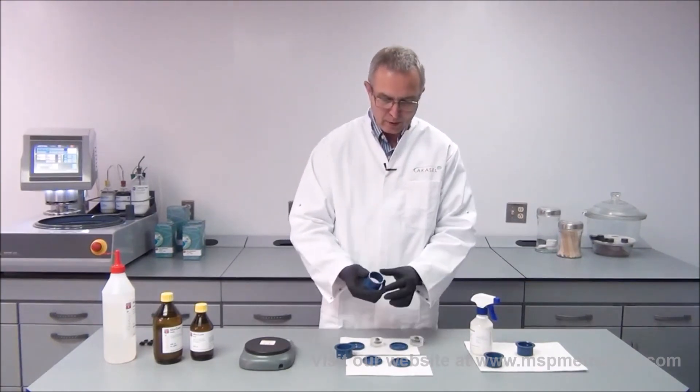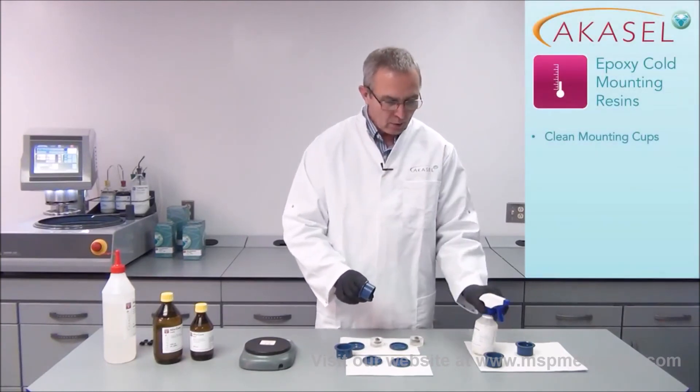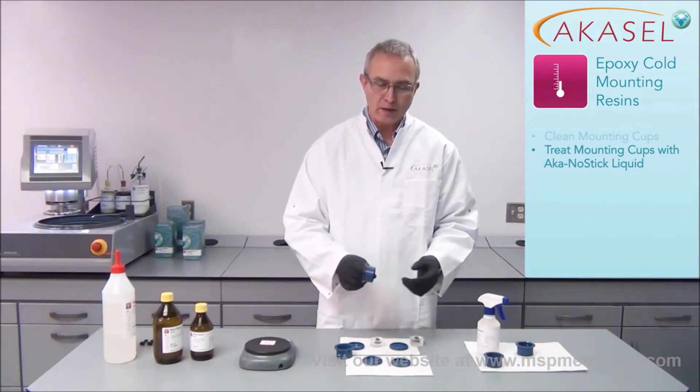Now I have removed my samples. I will clean the mounting cups and apply the Aka-NoStick spray immediately, then put them away to dry so that when I mount my next samples, they are ready to go.